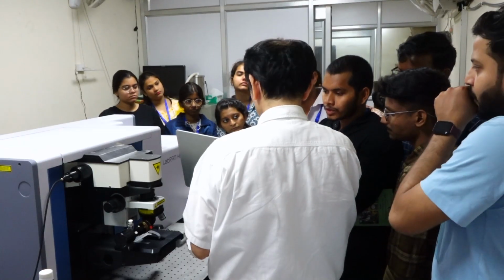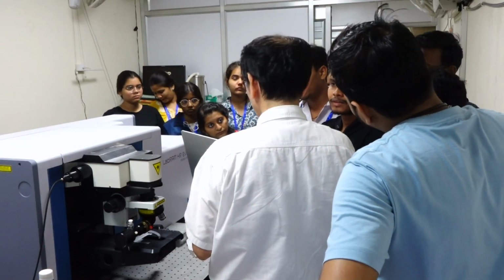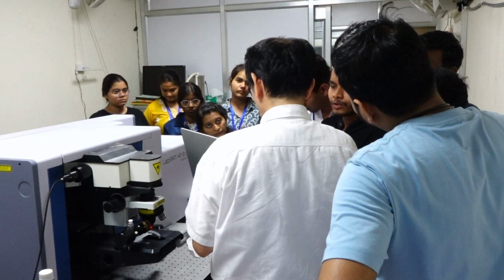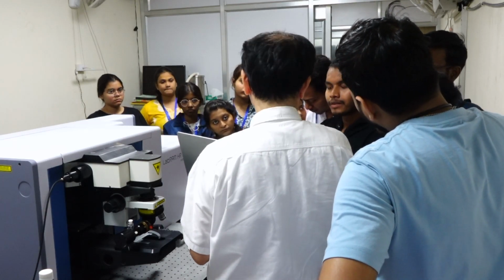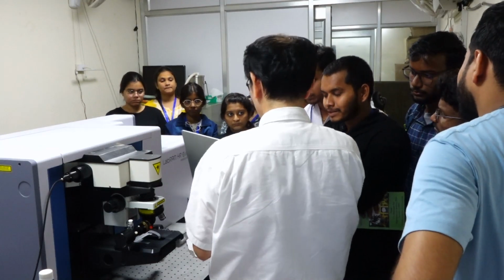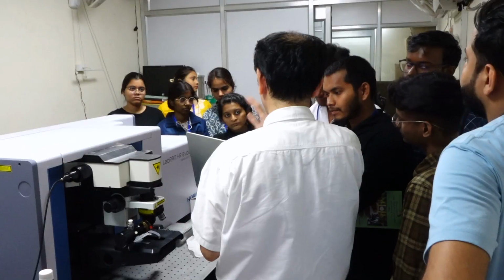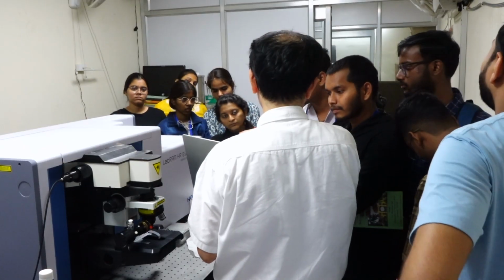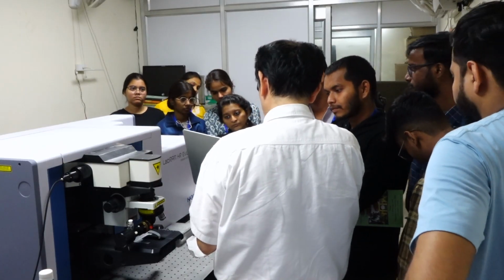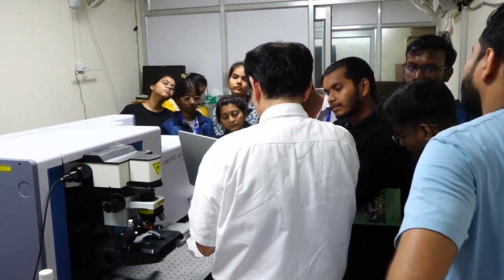If a solution contains two or more compounds, how can we distinguish? Compare with the model spectrum. Prepare the model spectrum in solution for several model compounds, list all the spectra and compare.